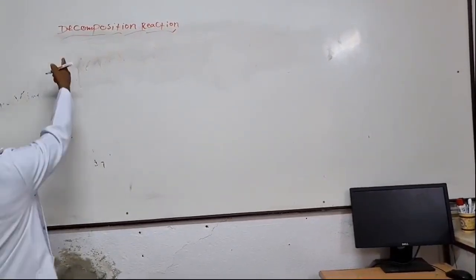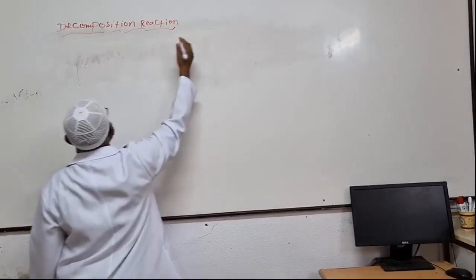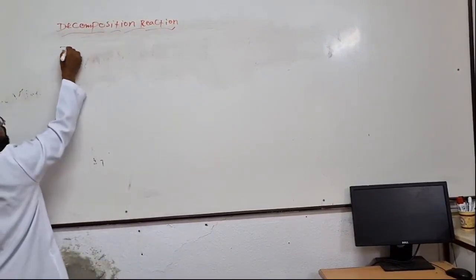Okay, this is a decomposition reaction. Decomposition of what?